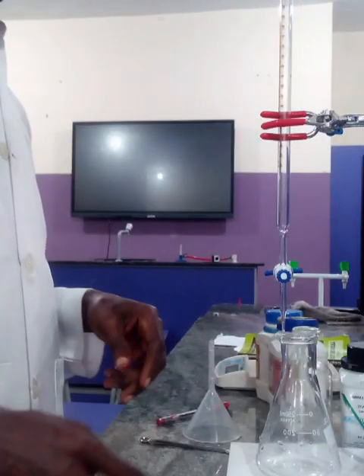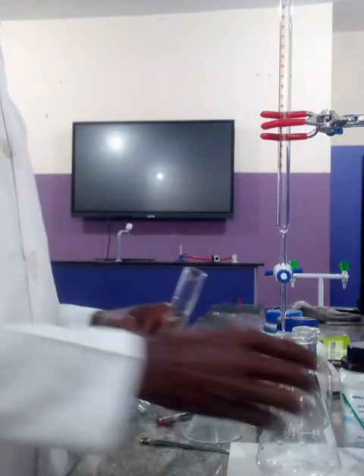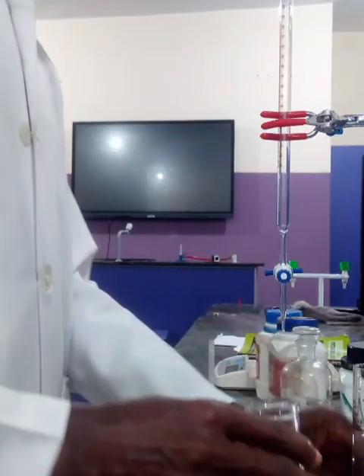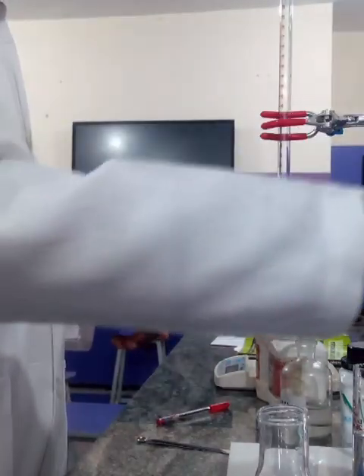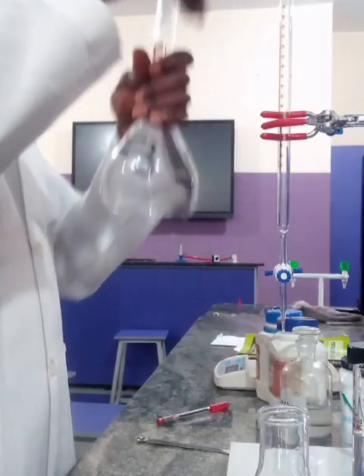Hello viewers at home, welcome to today's lesson. Today I'm going to teach you how to determine the concentration of the commercial bleach or the concentration of the bleach that you have made by yourself.